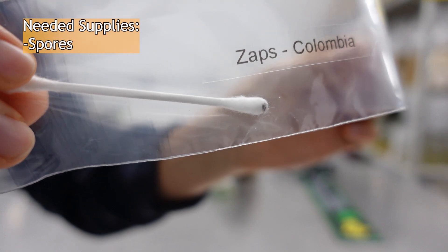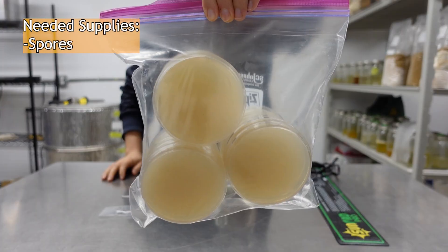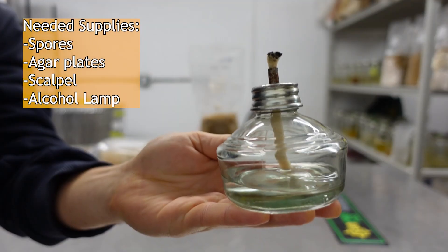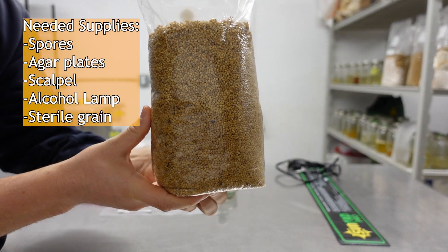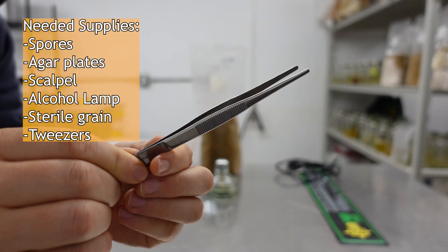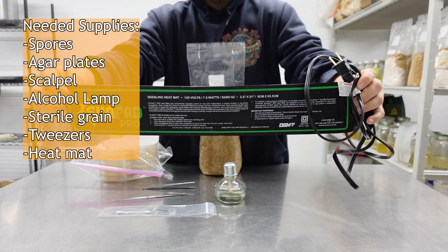To get started, you will need a spore swab, print, or syringe, sterile agar plates, a scalpel, a flame lamp or lighter, sterile grain and substrate for propagation and fruiting. Tweezers are recommended but not required. A heat mat or incubator is also recommended.